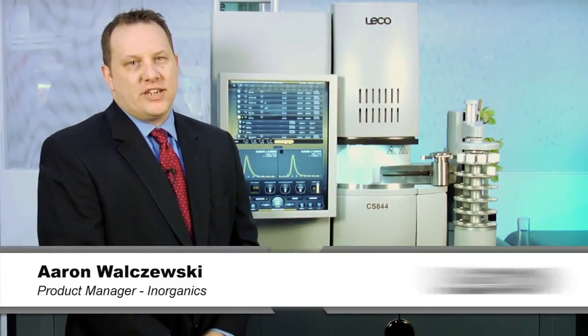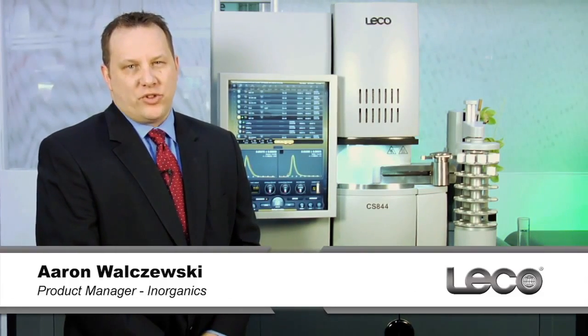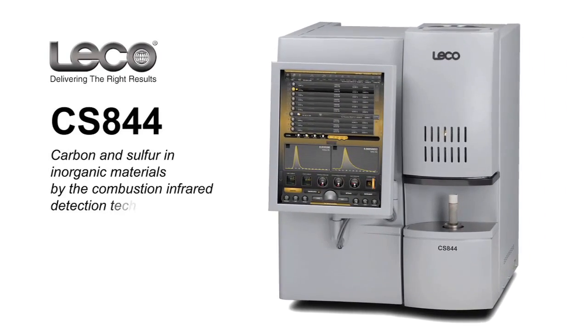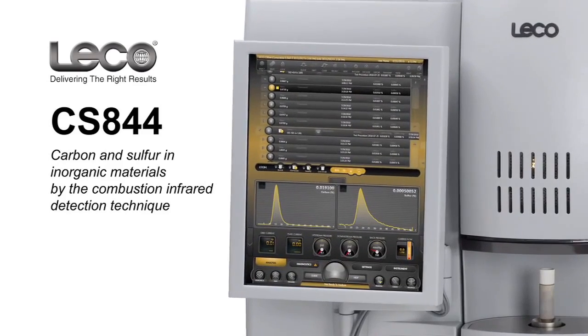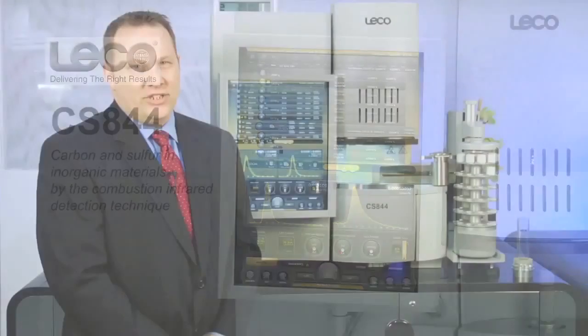Hi, my name is Aaron Walczewski. I'm the inorganic product manager with Leco Corporation, and I'm here to introduce the new CS844 Combustion Analyzer. There are several features of this system that I would like to introduce today.